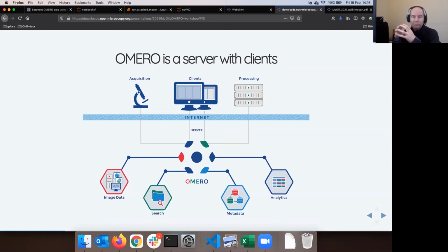The Ome team more or less is done with the job once it has shipped the Omero server, and ships, of course, upgrades as they come during the development process. Okay, all the rest is up to the hosting institution, and of course they have the money, power, and the say about how the Omero server in their institution is run. That's completely up to them. From there, the Ome team has no say, except for advisory things.